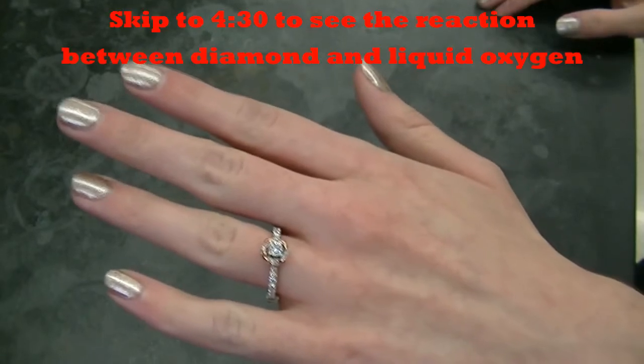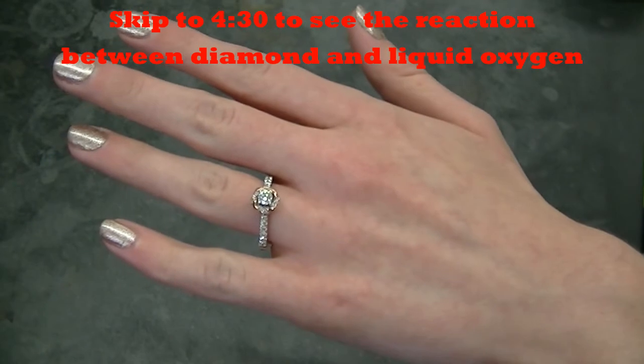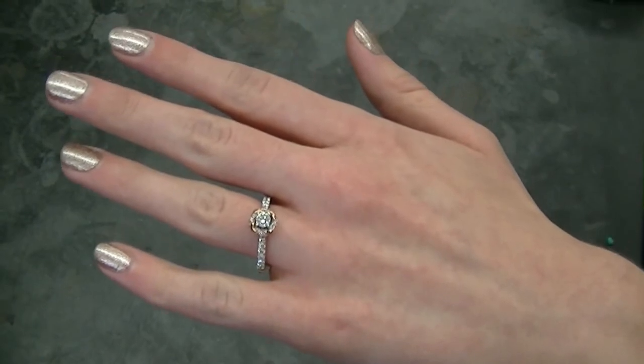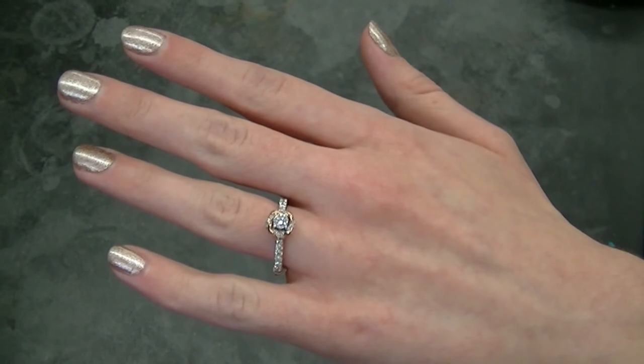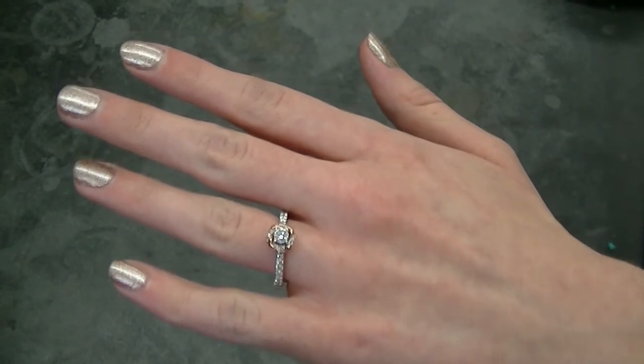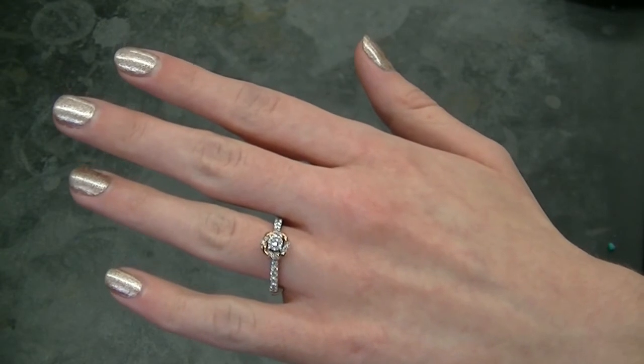It is often said that diamonds are forever. That's probably because diamonds seem to be virtually indestructible. However, in this video I will attempt to demonstrate that it's quite simple to convert diamonds to carbon dioxide gas. Maybe diamonds aren't forever after all.